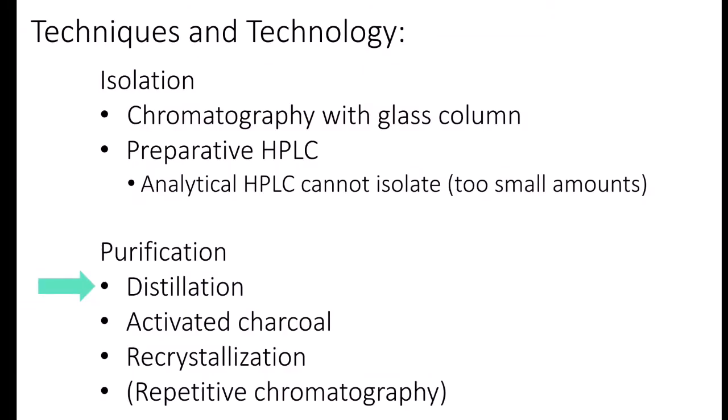Okay, next, purification naman tayo. Let's go to something that you are familiar with already, distillation. So distillation only works well with volatile compounds because distillation separates substances according to boiling point. So this might work well with essential oils like terpenes and other lipids.